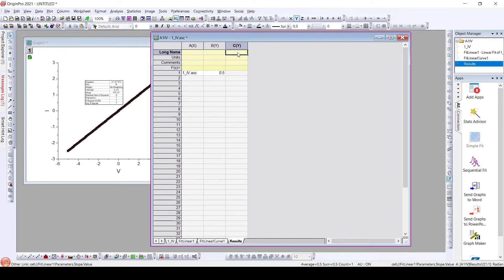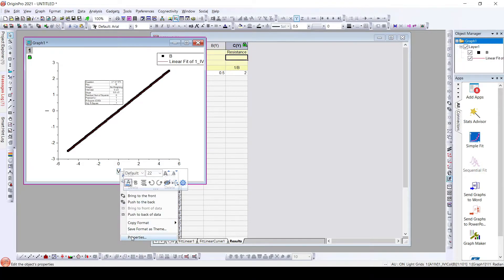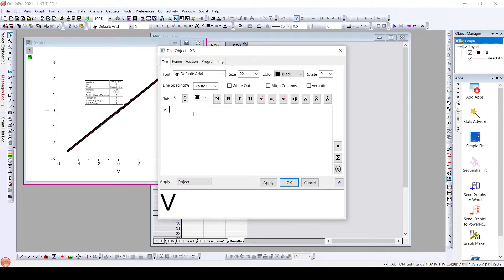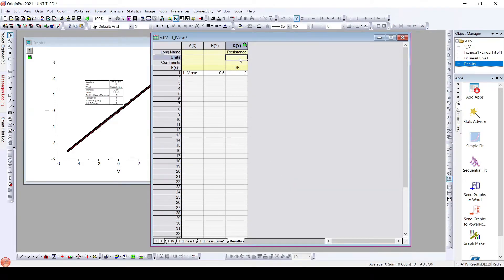Now I will add one more column called resistance, and it would be the inverse of the slope. So 1 divided by B will give us our resistance. The unit of this is ohms. To get that, I'll type capital W and change this to symbol, and paste the ohms symbol. So here we have calculated the resistance of this particular IV plot.